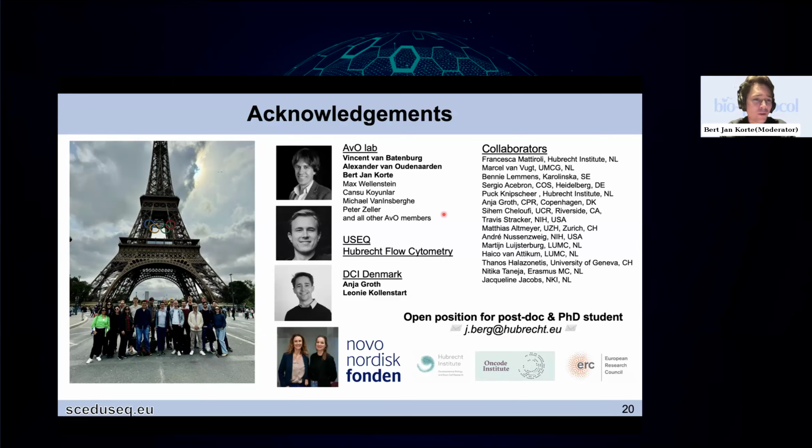Okay. We have another question, partially also from the website, which asks: can single-cell EdU-seq and/or these DNA fiber assays be used to measure replication dynamics in more bacterial or prokaryotic systems? Is this something you have looked at? No, we have not. And yes, in principle. I know, for instance, in yeast, you need to use specific yeast strains to incorporate BrdU, because BrdU is not normally incorporated in yeast cells.